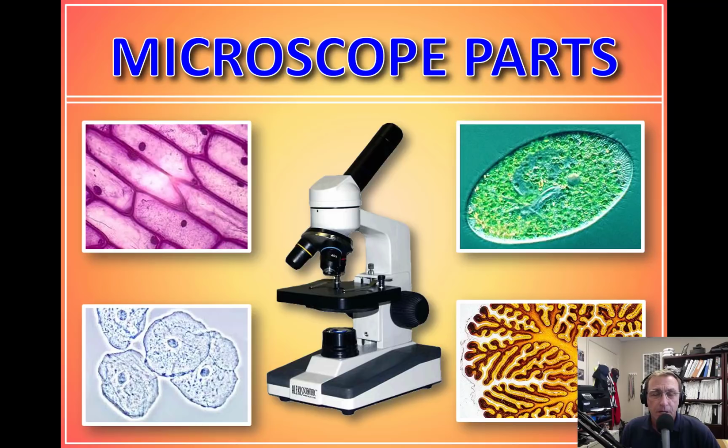Very importantly, even with our little microscopes that are sort of designed for children, you can still damage and break them, and they're nearly $100 each to replace. So you don't want to have to do that. So please pay attention not only to what things are called, but how they work and how you should work them.